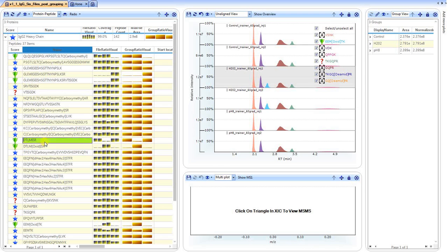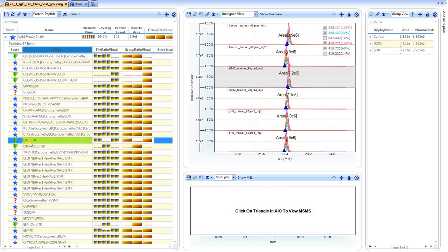So just quickly, if we highlight a specific peptide shown here, and of course it has a methionine, so we would expect it to show a stronger oxidation from the hydrogen peroxide samples, we can simply look at what the results are. So one of the overviews in Pinnacle for the antibody screening and quantitation is that I can simply look at the table and get an overview of what's happening for each individual peptide through these gel views.